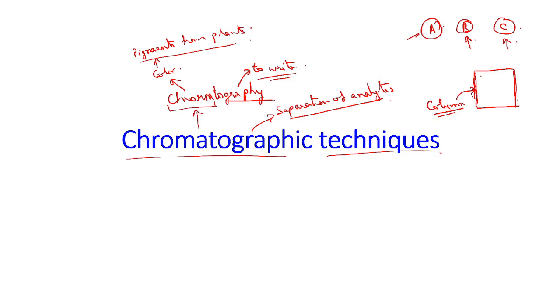So during the party, all of your members will be present and they will not change their properties as such. So you and your group members or your family members are regarded as the stationary phase, because you are not changing your property, and it is expected that throughout the party you will be present over there. That means you are a stationary factor during the party. So this A is the stationary phase.